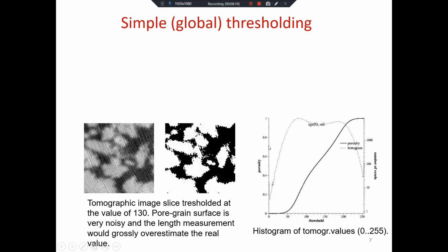That's really fast, but this image, and I already see that this is a pretty bad image. This is the evidence of it being bad. Look at the peaks. I barely have peaks. They almost overlap. Even though I have a decent portion, pretty much close to a half of this image is empty, or in this case, oil phase.